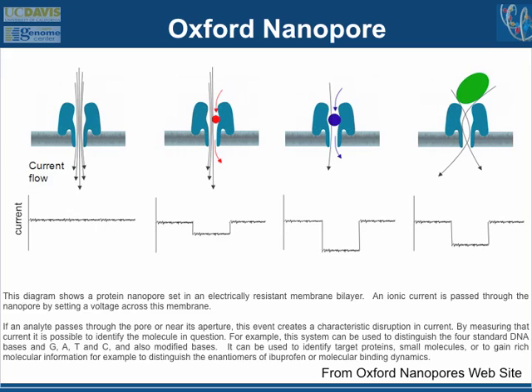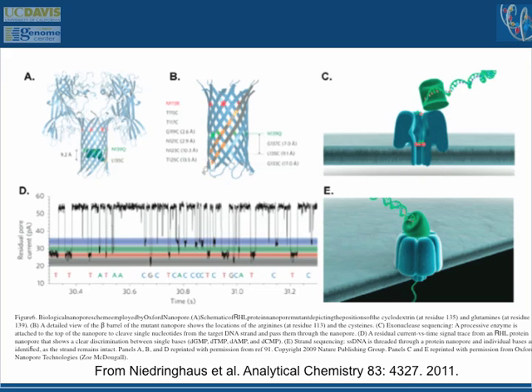And what they've been trying to figure out for many years is how to adapt this technology to do DNA sequencing. And what they've managed to figure out, at least they claimed this at this Marco Island genome meeting about a month ago, is a way to, more accurately than they've been able to do, use these nanopores to track a DNA sequencing reaction and to track, in essence, the charge and electrochemical changes that happen during a DNA sequencing reaction.